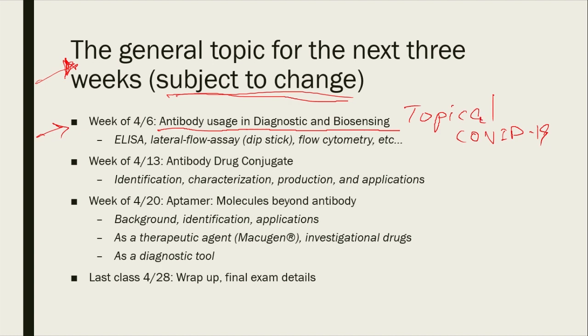Now, in today's topic, we're talking about nucleic acid diagnosis, right? We're doing PCR to generate genes, to see if that organism is present. But there are many other ways to do diagnosis. We're going to talk about it, and potentially the assignment is also related to what we're talking about, so it will still revolve around the COVID-19 diagnosis topic.